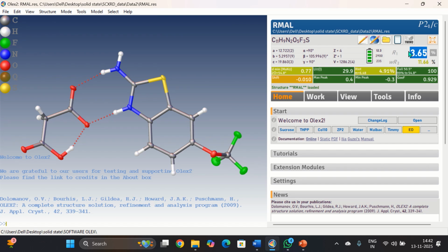F is the structure factor, and the intensity is proportional to the square of the structure factor. The structure factor is already given in the file which was uploaded, and it is for each HKL present in the unit cell.